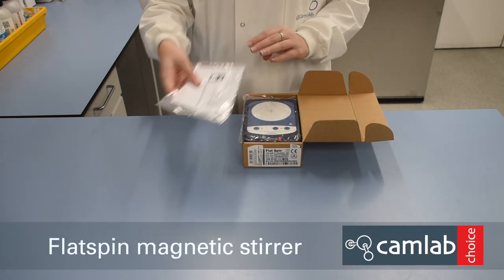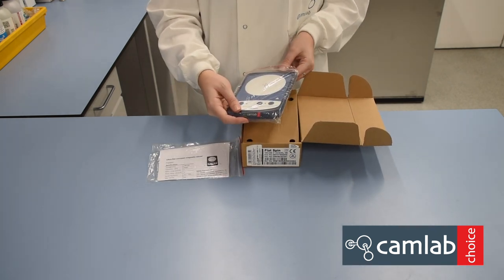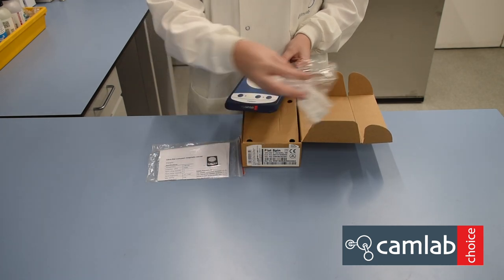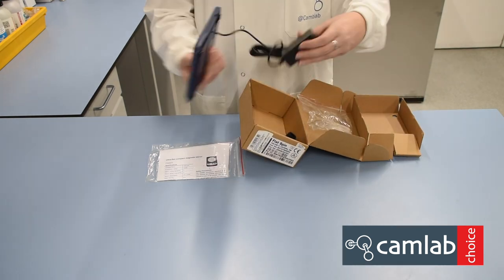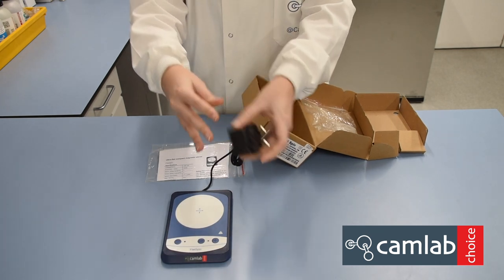In the box you have the user manual, the CamLab flat spin, with a power adapter and a UK plug.